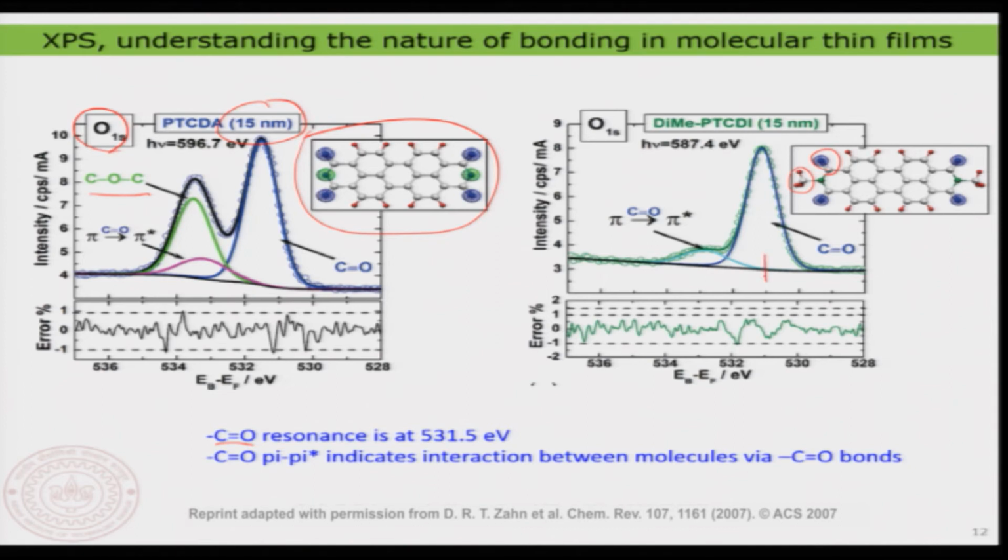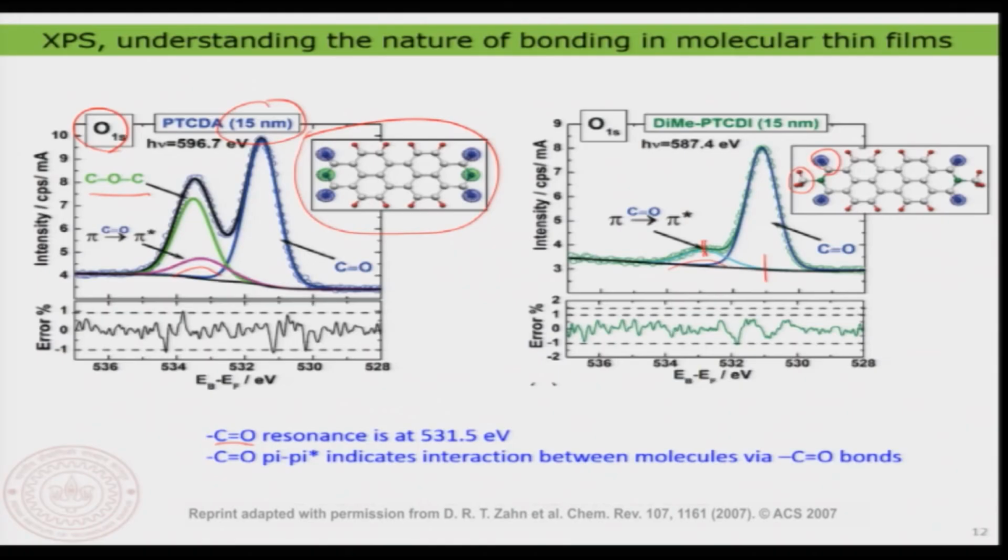But now the interesting thing is that both of these molecules have a very particular resonance, which is marked here as a pi star resonance. So, it is a new electronic state that comes up when the molecules are packing in a stacked manner. The molecule is a planar molecule. So, when you pack the molecules above each other, however they grow, the packing is a kind of pi interaction, and you see this resonance, which is very particular when molecules pack in this fashion. You observe this for molecules having a large pi electron cloud, and when they interact like that, you see this resonance, which is an electronic state, a transition between pi and pi star.